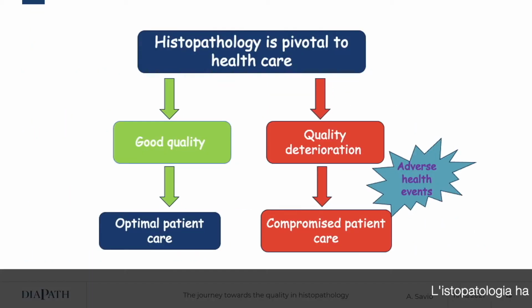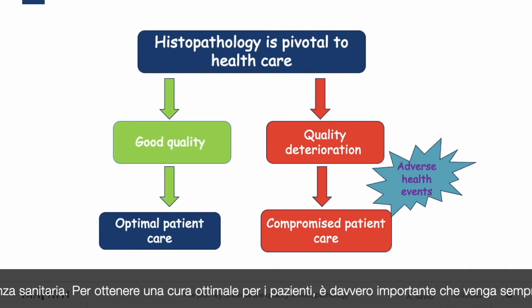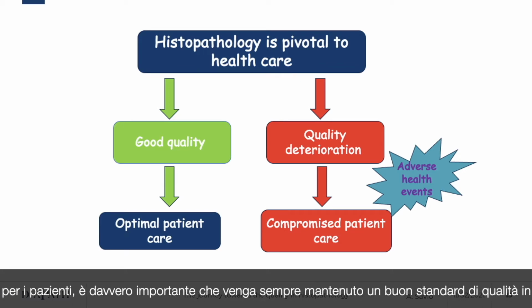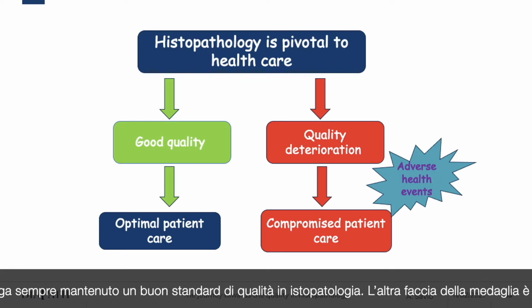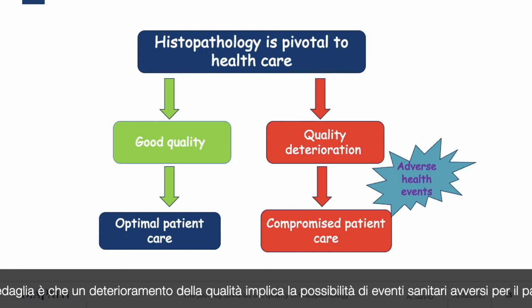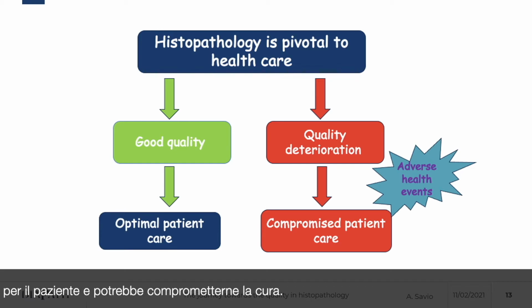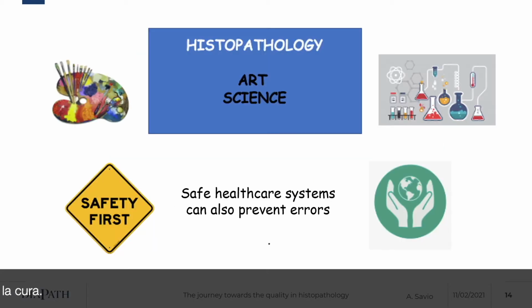Histopathology is pivotal to healthcare. To obtain the optimal care for the patients, it is really important that a good quality standard is always maintained in histopathology. On the other side, a quality deterioration means the possibility of adverse health events for the patient and might compromise the patient's care.